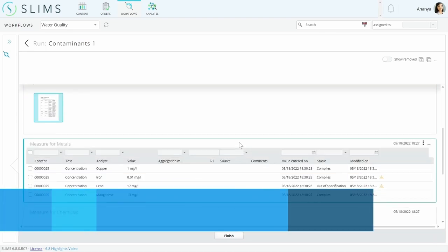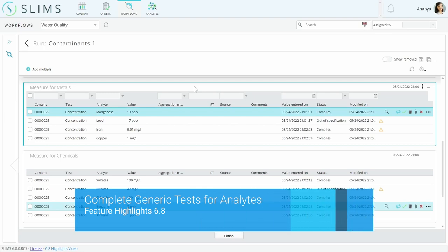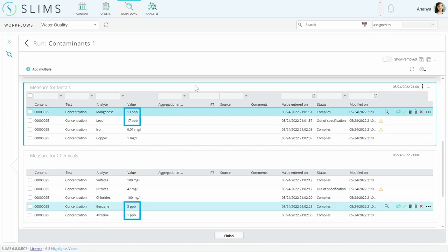More results are being imported on this protocol than the first one. Since all the analytes we're measuring use the same generic test, we allowed choice of unit within the same dimension on the test.